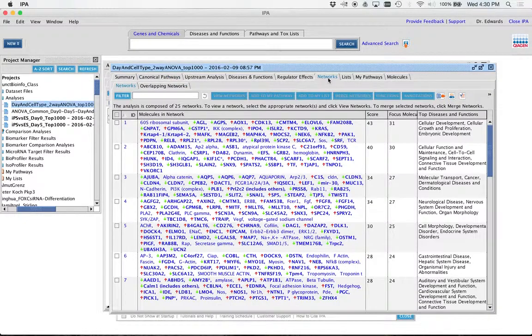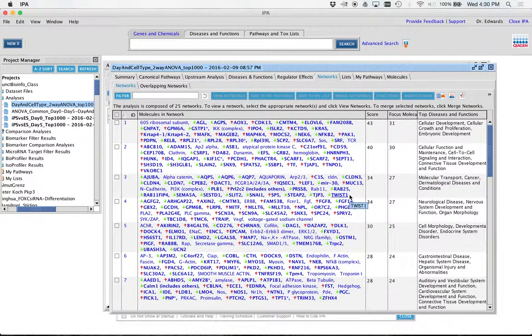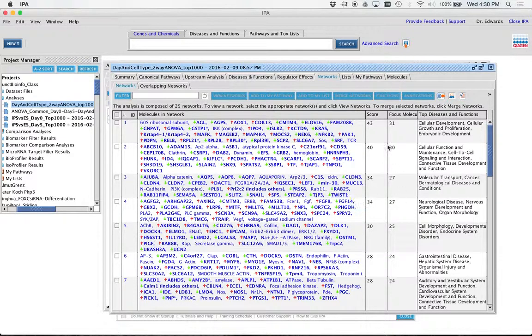Let's go to networks. Again, remember, this is where they basically group genes based on any biological connections, regardless of whether they're in the same pathway or not.